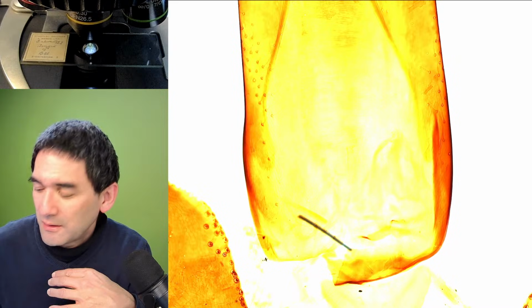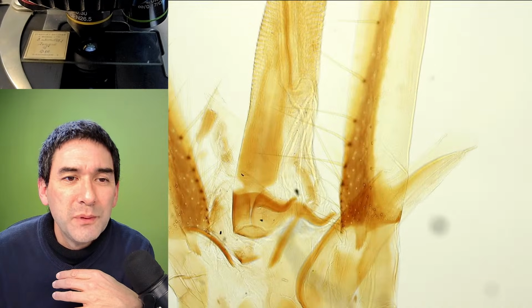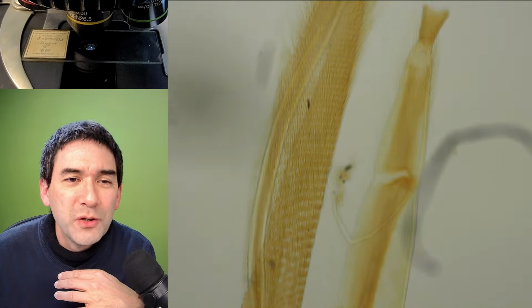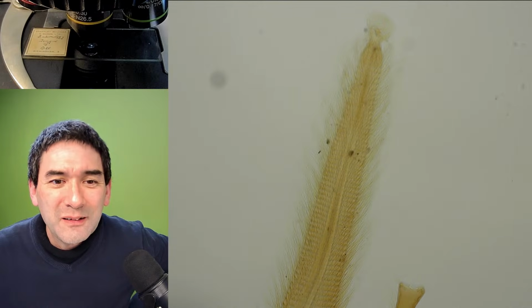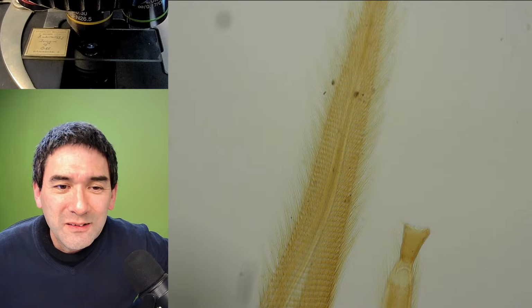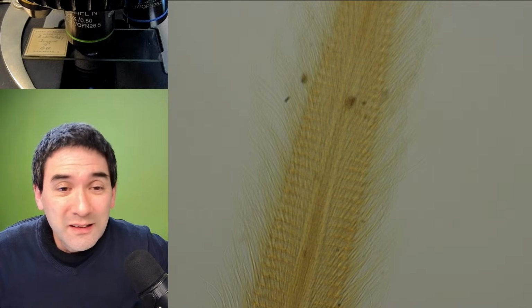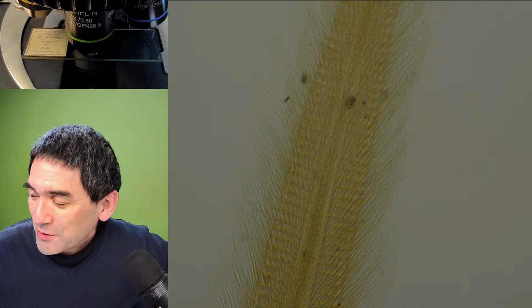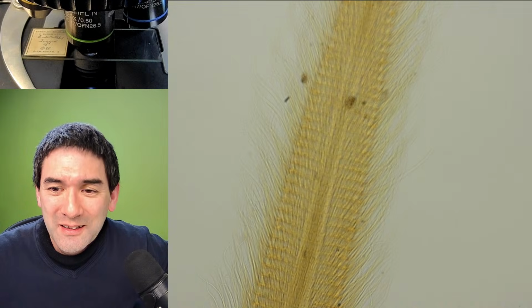But I think this one has been prepared specifically and beautifully. So that is basically what you see over here. That's the tongue of a bee. I'm always surprised, not only at the beauty of nature, but that this has to be preserved somehow, and that with proper preservation it was able to survive, let's say, 100 years or longer, is quite surprising.